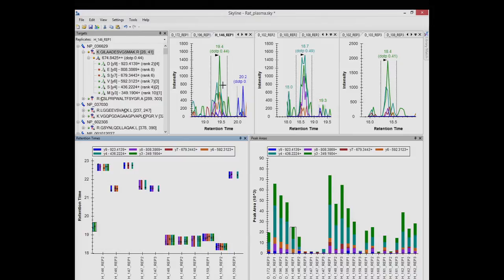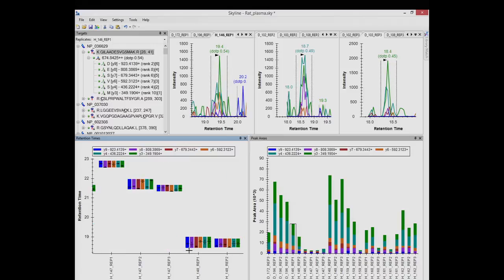But since we're going to be in quantitative mode, and presumably Daniela Tomazella has done some refinement of these values already, we just want to tell Skyline to integrate everything between the peak area boundaries. The way to do that is to click on settings and then click integrate all. Once you do that, you'll see that the blocks for the retention times fill out. But as long as we're in this zoomed in view, I'm even going to zoom in a little bit more maybe.